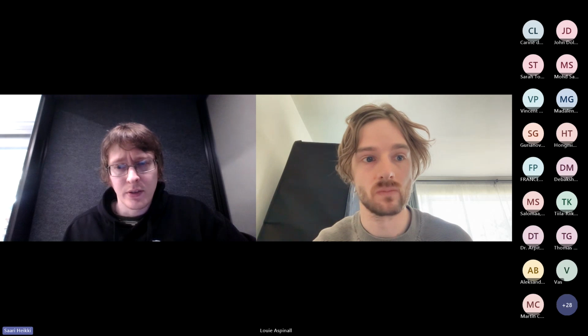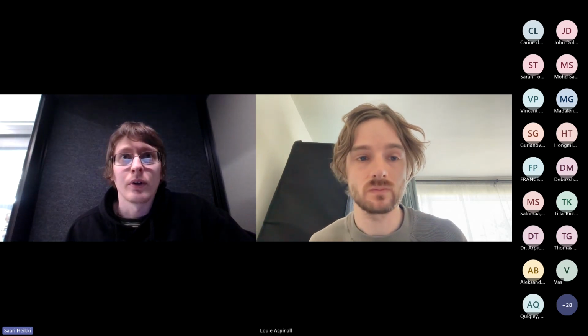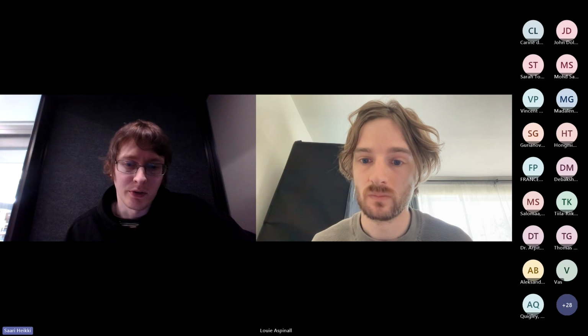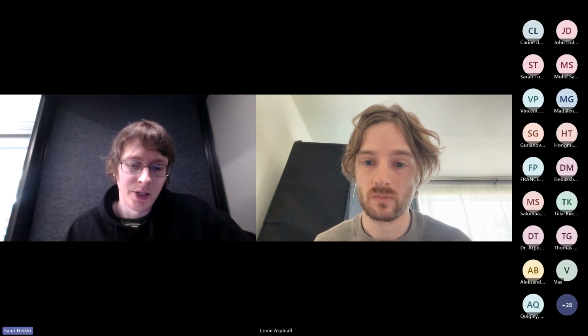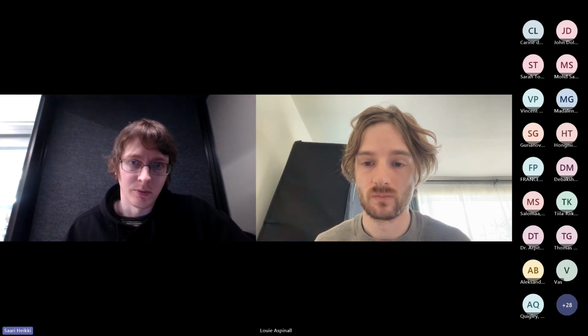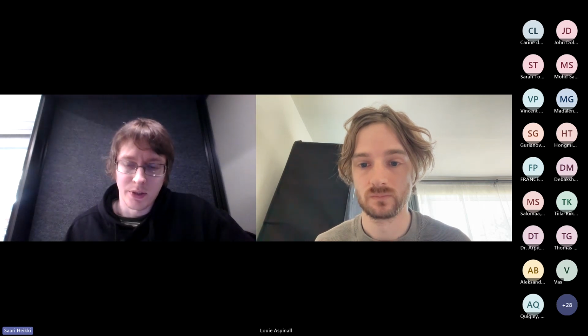Yeah, the yield question is quite complex, I think. I find that it really depends on the sample more than anything else. If you have a very pure sample with EVs, you actually may lose a lot of EVs into the column. And if you have a very dirty sample, you get very nice yields.